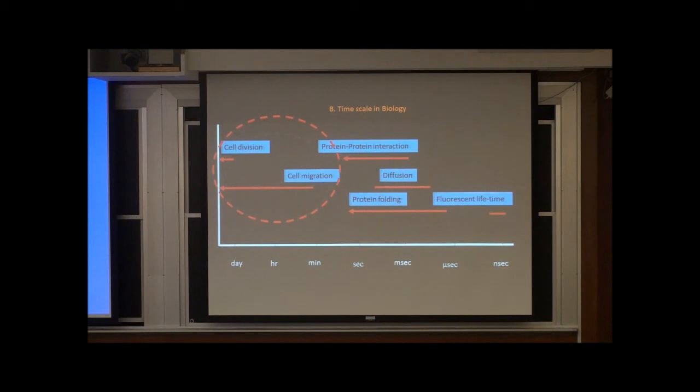This is very challenging with present-day techniques like confocal and spinning disk. Many of you are using these techniques, and you know that if you take thousands of layers of images in one or two scans, you bleach out all the fluorescence, so you can't image for such a long time continuously.